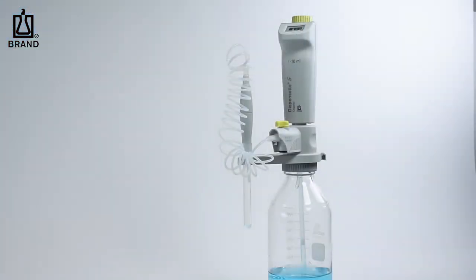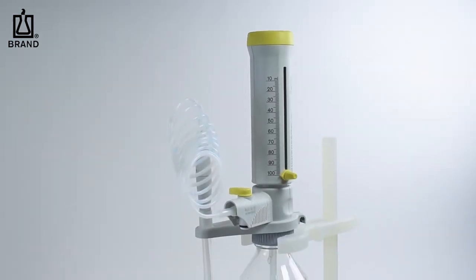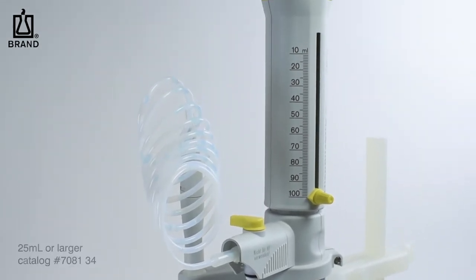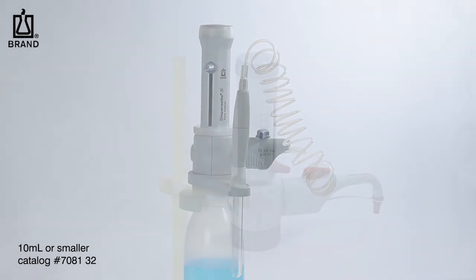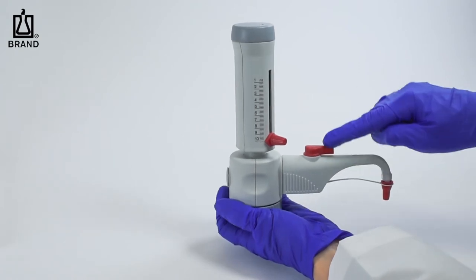Before installing the flexible discharge tube, first select the correct flexible discharge tube for your instrument. For larger Dispensette S models, those with a nominal capacity of 25 milliliter or larger, choose catalog number 708134. For smaller Dispensette models, including the trace analysis version with a nominal capacity of 10 milliliter or smaller, choose catalog number 708132. To install the flexible discharge tube, simply take an empty, clean Dispensette S.